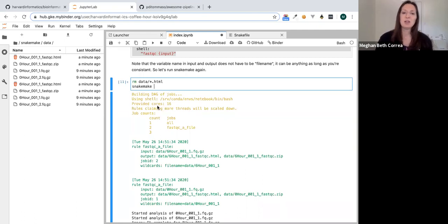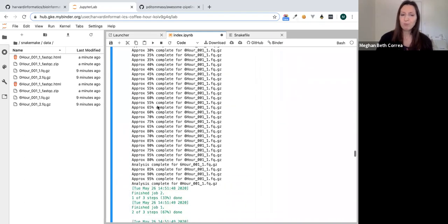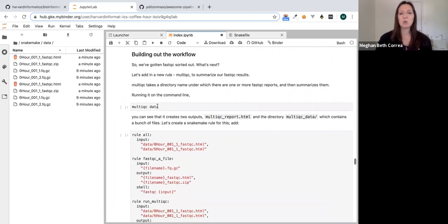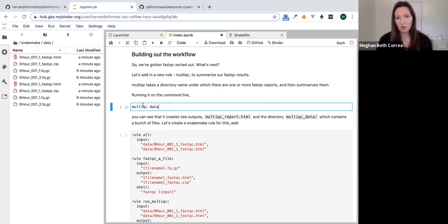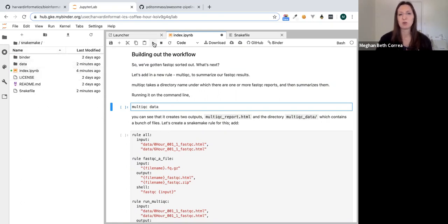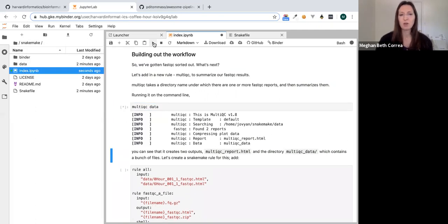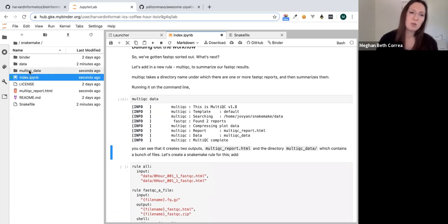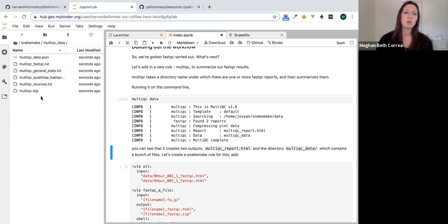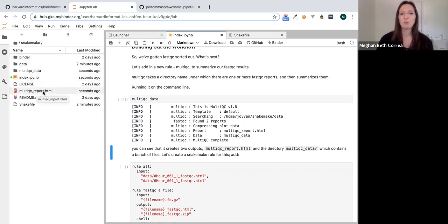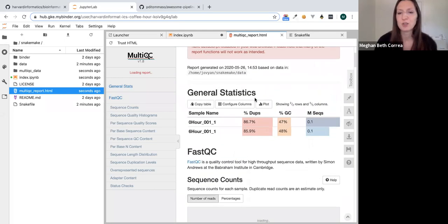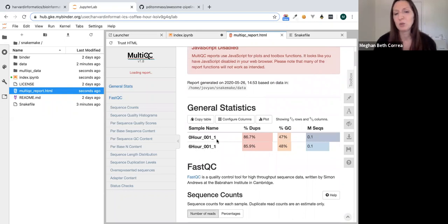It's very handy how easy it is to run things in parallel with Snakemake. Those two jobs finished, and now we have a pretty nice FastQC rule that will work on any file. Let's add a second rule to run MultiQC. The command is simply 'multiqc data'. It creates a multiqc_data folder with statistics and a multiqc_report.html, which combines statistics from all your samples in one file.